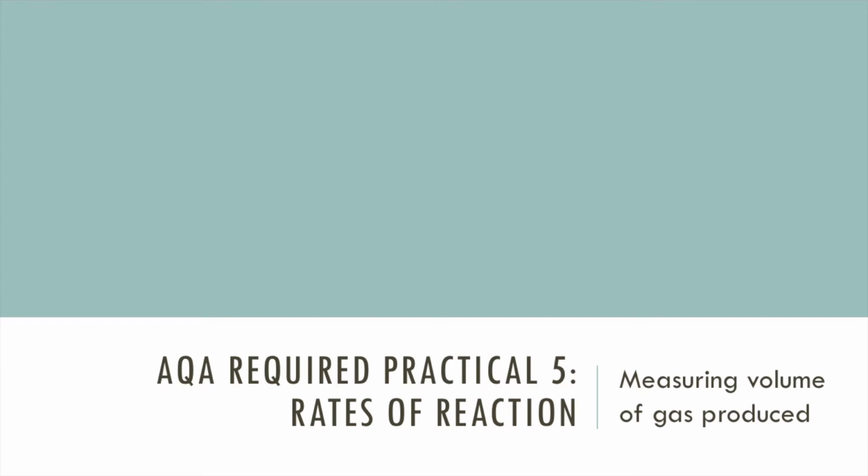In this video, I'm going to walk through a required practical from the rates of reaction topic. There are two required practicals in this topic, and this video will focus on one of them. We're going to calculate the rate of reaction by measuring the volume of gas produced in a reaction.